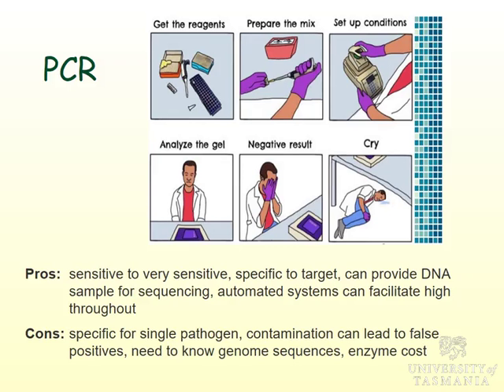I remember some labs where they go and do their extractions in a different building and then bring it back there and do the amplification, because once you go to the amplification process, you're producing billions of copies of your target. That is your major source of contamination. So if you do extraction in a completely different room or different building, there's less likelihood of contamination.